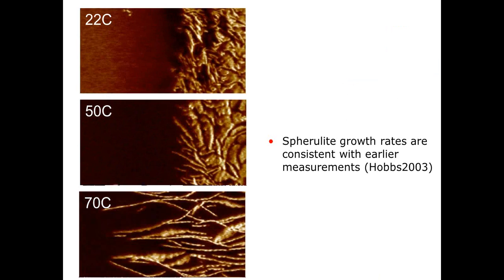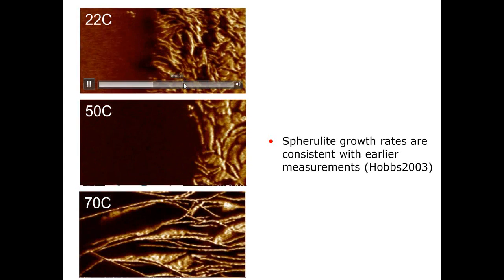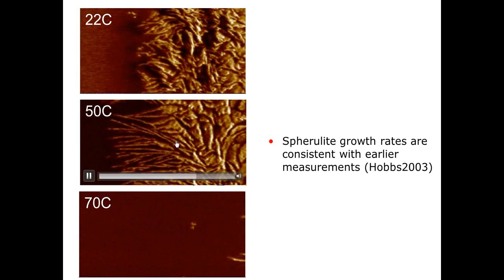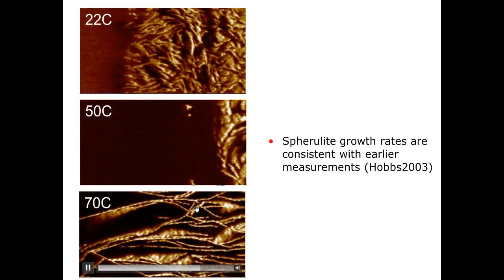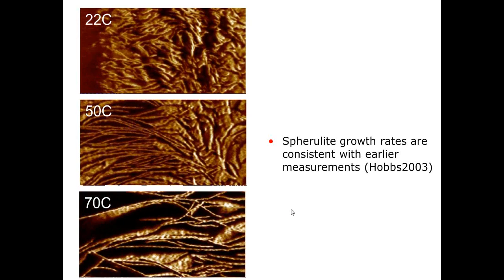And here again, the polymer, but it's done at different temperatures. You can see the growth rate, how fast the front moves. At high temperature, it's much faster.